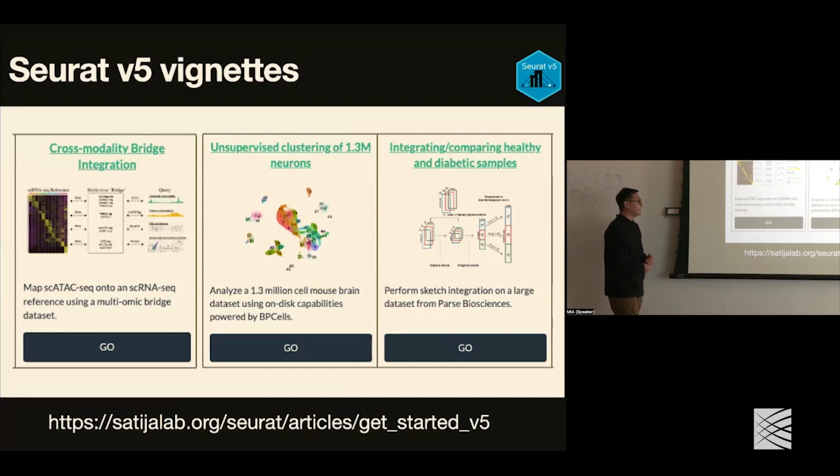Right, so that depends on how we process our bridge data, the multiome data. If we only generate the cell graph using the RNA-seq in the multiome data, yes, we will lose all the ATAC-seq signal, those unique signals. But like I mentioned, we get the graph from the multimodal data using our weighted nearest neighbor graph.